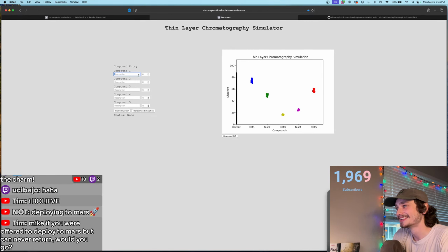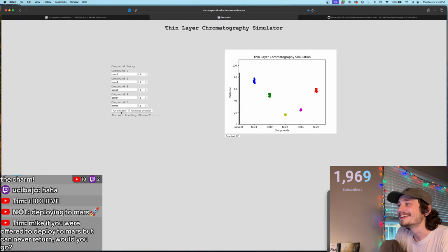Okay, let's see if this works. Ready? Comp 1, RF 0.9. Comp 2, 0.8. Comp 3, 0.7. Comp 4, 0.6. Comp 5, 0.5. Run the simulation. Come on, baby.